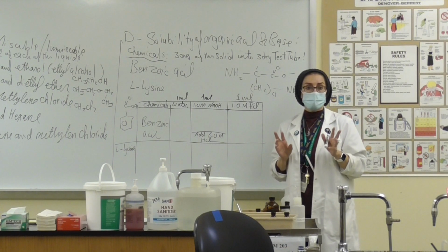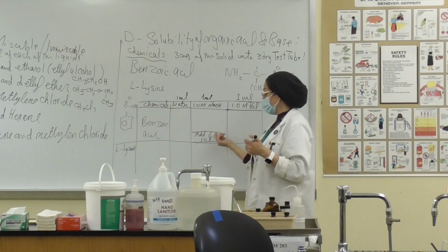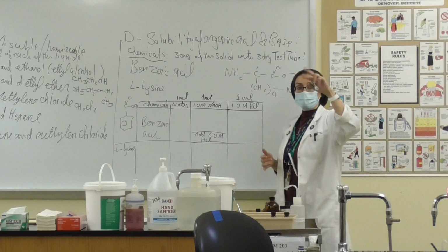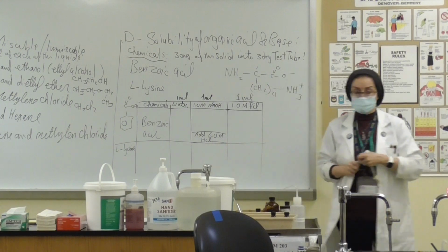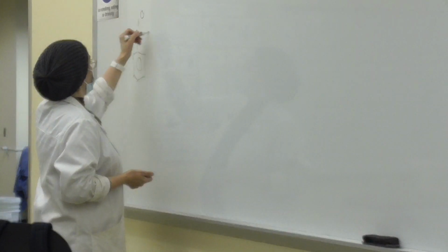Observe. Okay? So maybe, because it is an acid, it is going to react with the base, and then we want to return it back into the acidic part, right? Now, remember, if I want to show you what is going to happen, C double bond OH.